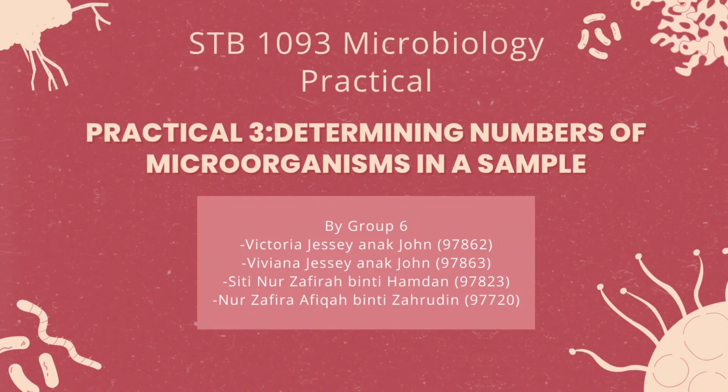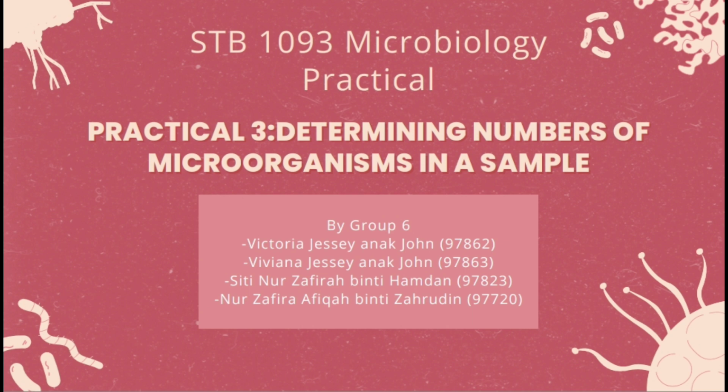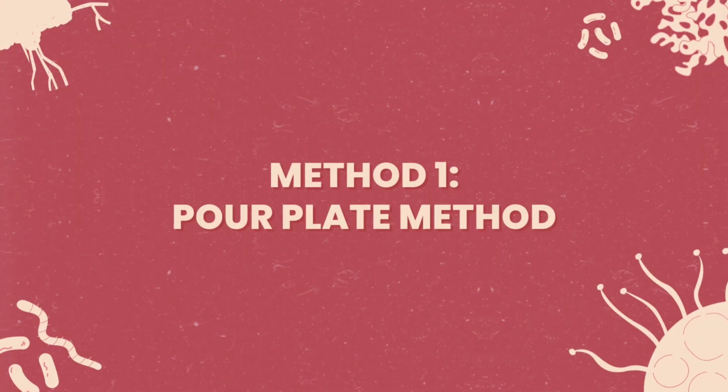Microbiology Practical 3. Determining numbers of microorganisms in a sample. Method 1. Pour plate method.